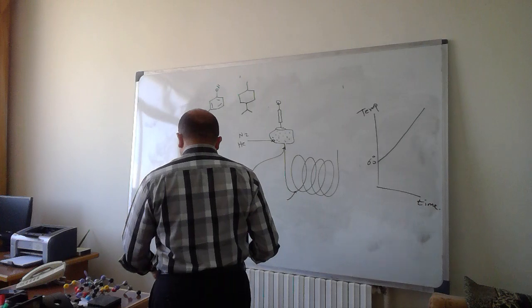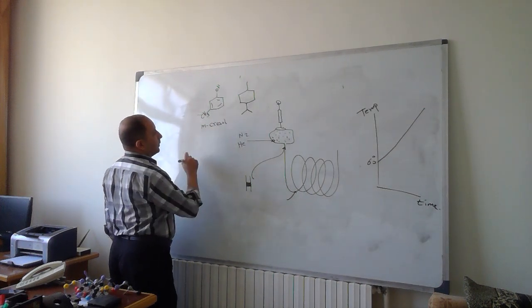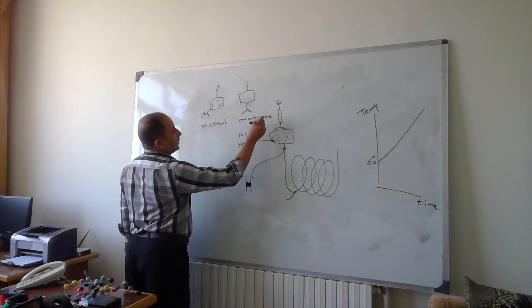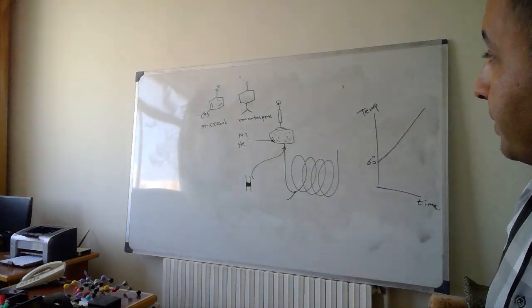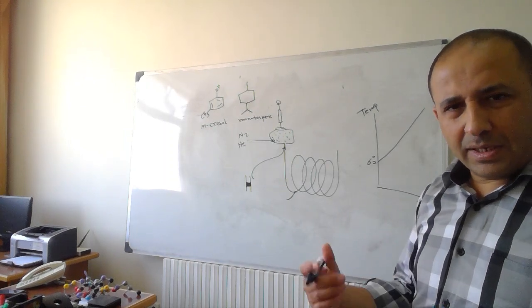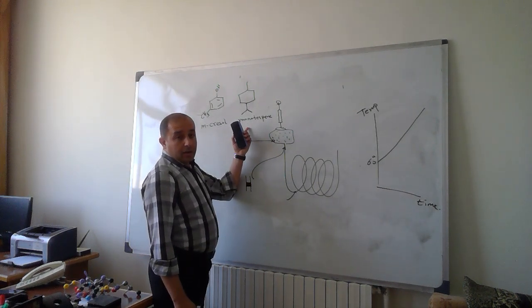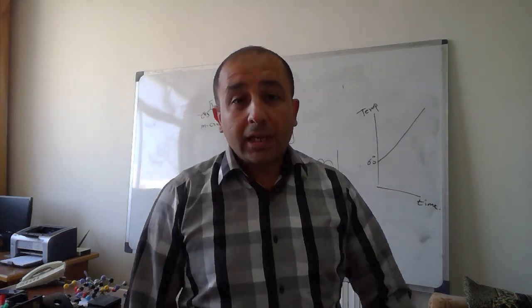So we have metacresol here, one of the phenols, and this is a monoterpene, the basic structure of many volatiles. So monoterpene is more lipophilic, and it will be more volatile. Due to its hydrophobicity, it will volatilize quickly.